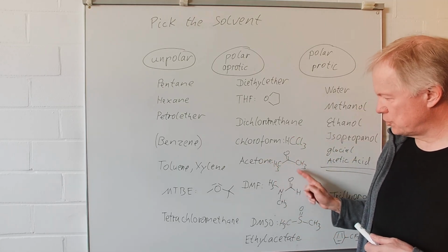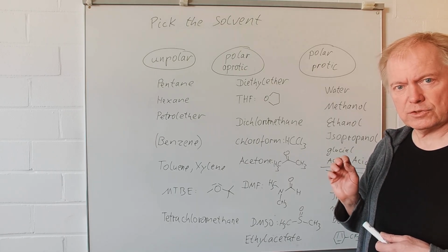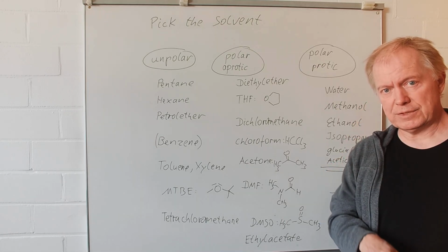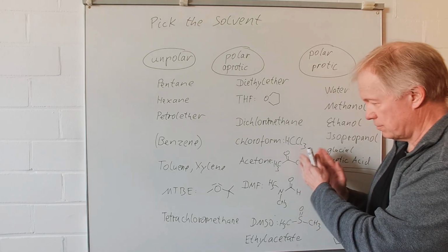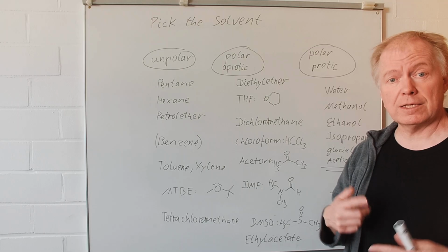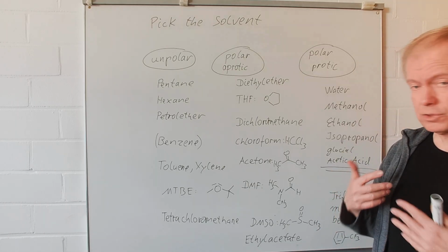Well, acetone, a very nice solvent. However, under acidic and basic reaction conditions, it will react by itself, with itself, aldol addition, aldol condensation.